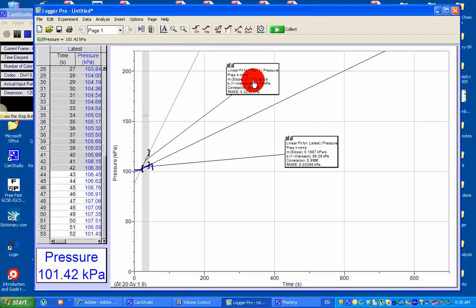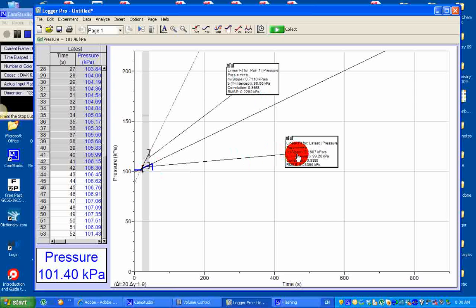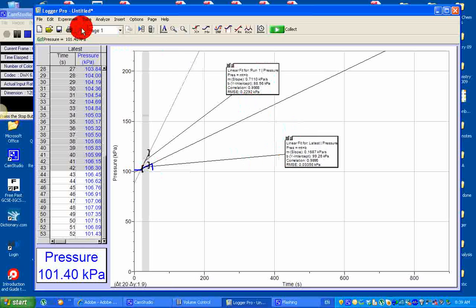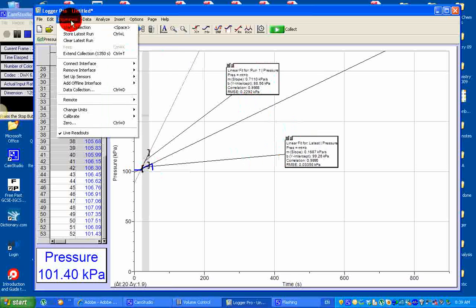Whereas the blue line represents the rate of reaction at lower concentration, which is 0.16. At higher concentration, the slope or steepness is 0.7, which is higher. At lower concentration, the slope or steepness is 0.16, which is lower. Under experiment, store my latest run, and file — save it. That's the end of this video tutorial.